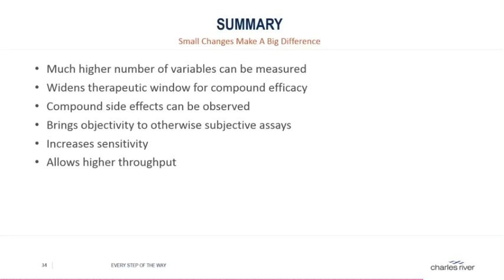To summarize, the fine motor kinematic analysis method offers a tool to investigate detailed gait properties and subtle yet highly significant changes in rodent models with motor deficits. It produces up to 100 individual parameters of different aspects of gait and fine motor movements. Further, the principal component analysis reveals correlations between individual parameters, providing a comprehensive overall view on the movement patterns.